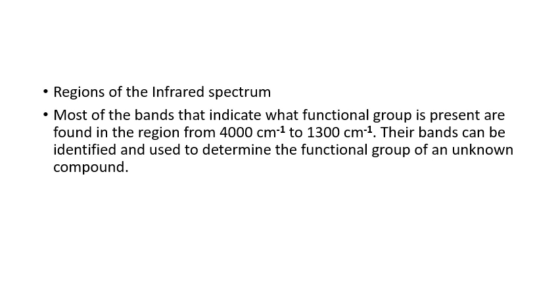Their bands can be identified and used to determine the functional groups of an unknown compound. Suppose nitrogen and hydrogen are present, then the next question will be what is the bond between N and H, whether it is a single, double, or triple bond.